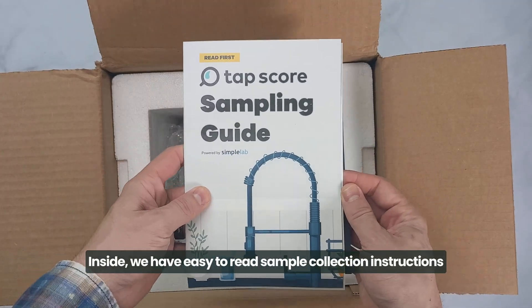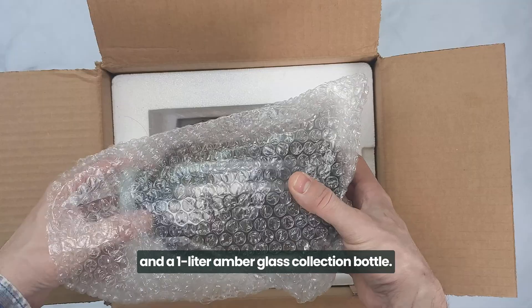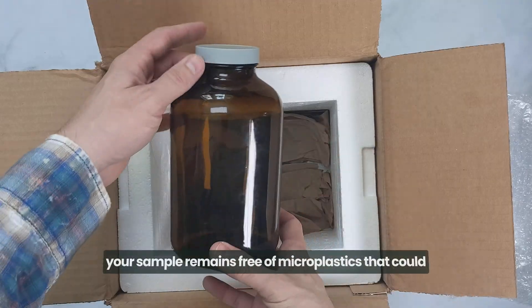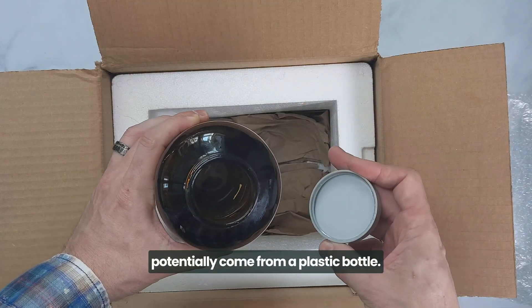Inside we have easy-to-read sample collection instructions and a one-liter amber glass collection bottle. The bottle is made from glass to ensure your sample remains free of microplastics that could potentially come from a plastic bottle.